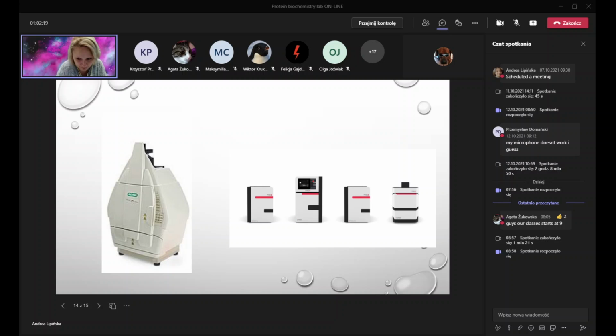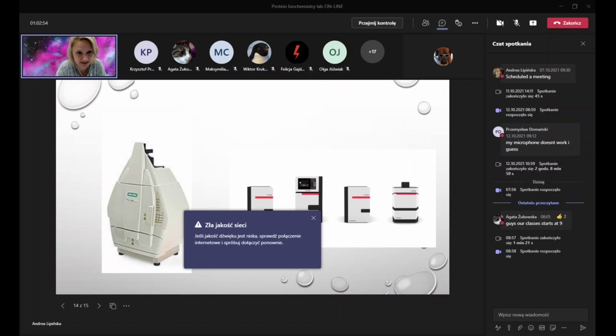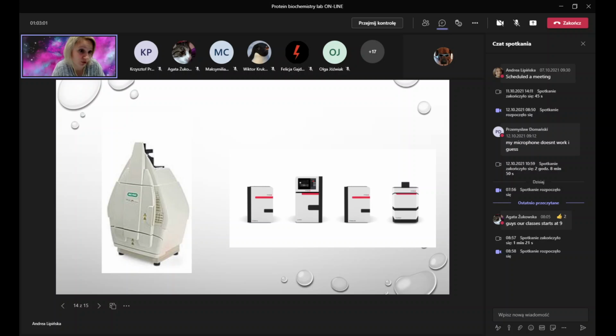And there are also different types of pores of the membrane. For example, for small proteins and peptides, with water or buffer. Whereas with PVDF, you have to make it wet using alcohol, like methanol usually. And nitrocellulose will dissolve in methanol. So if you mix those two, you may end up with just a damaged membrane.